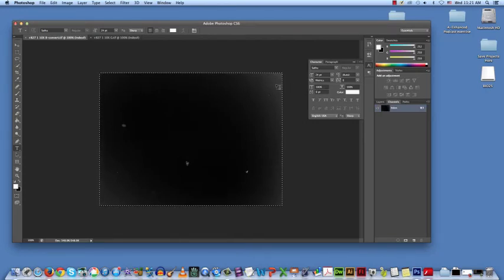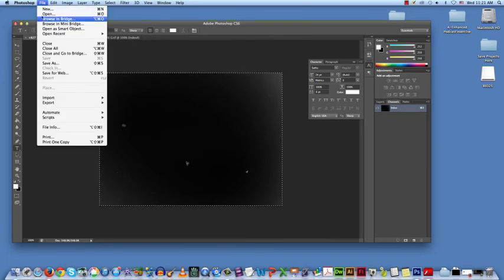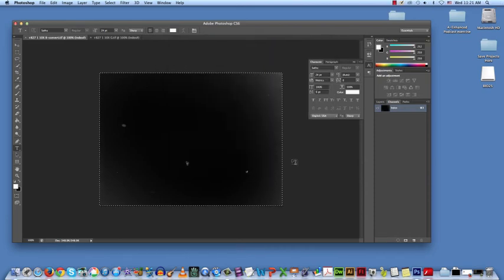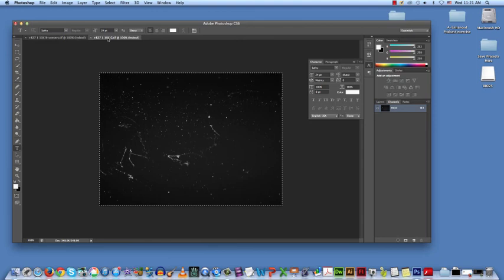Once you're ready to analyze your images, you need to move them into Photoshop. So open your images in Photoshop by simply using File, Open and then finding the correct TIFF image in your files. Now here is the DAPI image that I've taken from one group and the corresponding neuron image from the same group, or at least what I hope is corresponding.